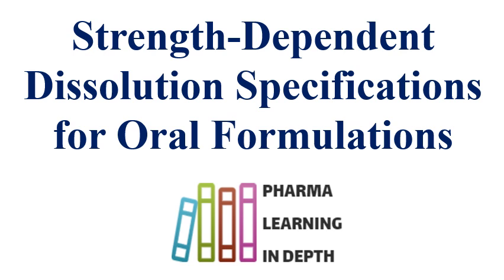The medications are available in different strengths as per the indication and the disease condition, as per the patient requirement, and as per the safety and toxicity profile of the molecule. All these formulations are required to be tested for dissolution. Dissolution testing is an in vitro test to understand the product behavior in vivo.